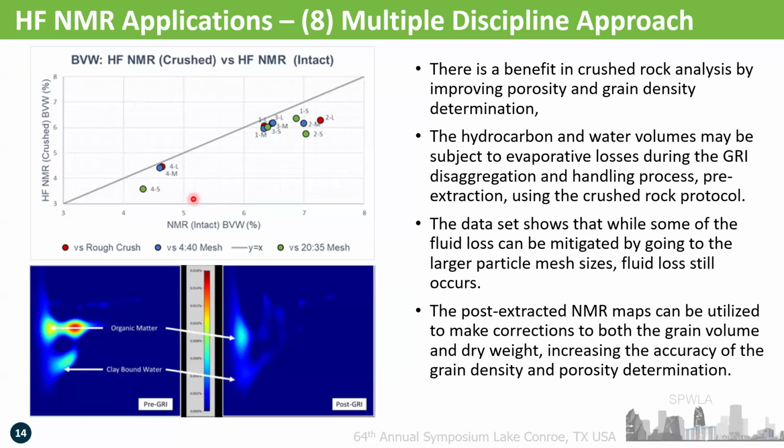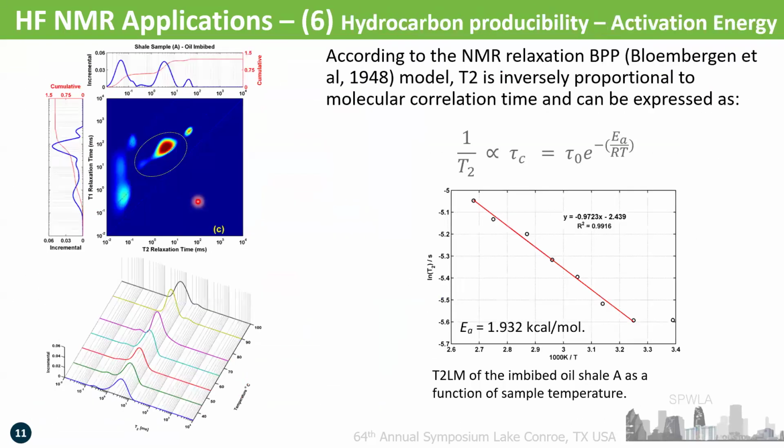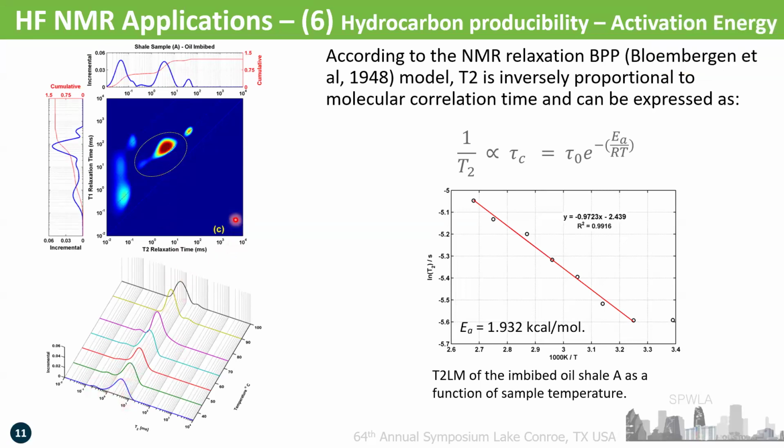Okay, Harry, there was this activation energy slide that you showed. My simple question is, the T2 logarithmic mean you are taking for calculating the right-hand side, it will be within that region, right? Not the total T2 logarithmic mean. Correct, with the circled region. So that means we pick up this oil signal and plot it here. Just that region. Okay, so you're discarding the other components. Right, just that particular region. Yes. Okay, that makes sense.